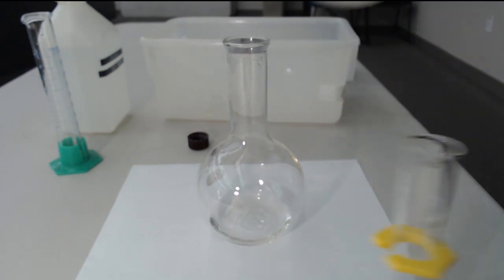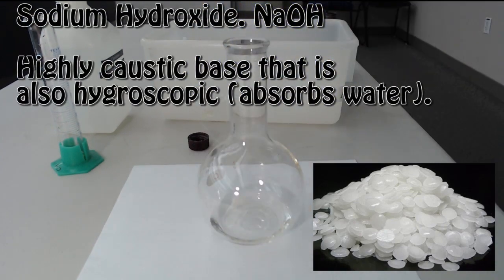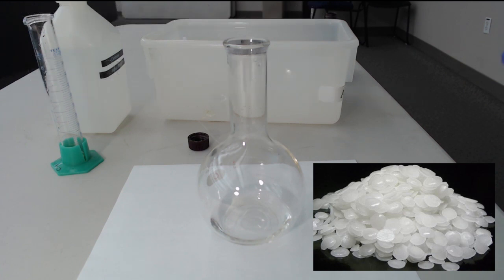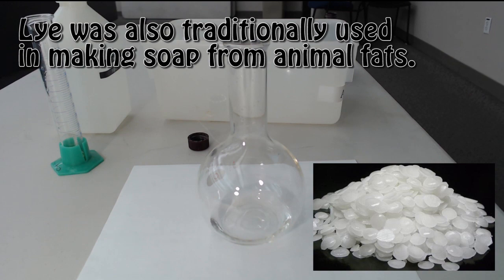And then what I have here now is sodium hydroxide, NaOH. We talked about this a couple times. You remember what the common name was by chance? It's commonly called Lye, L-Y-E. And it's actually typically the number one ingredient in things like oven cleaner or Drano.